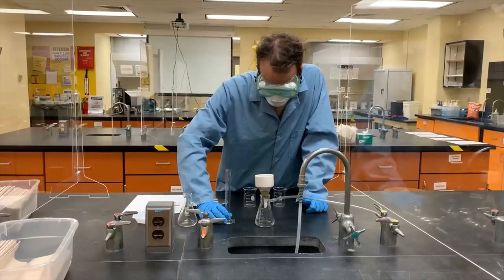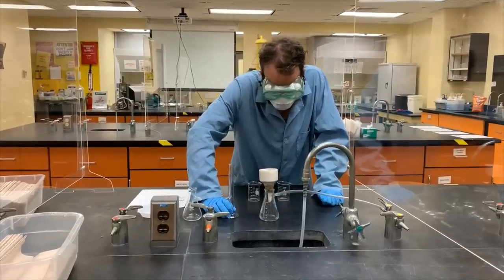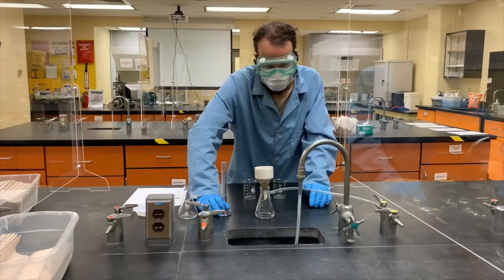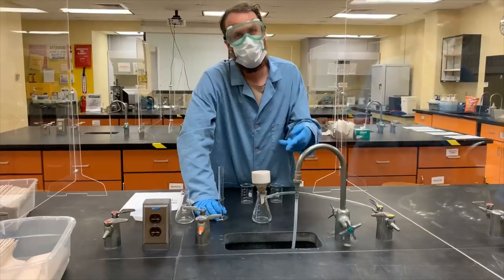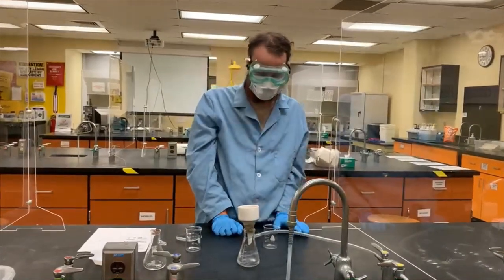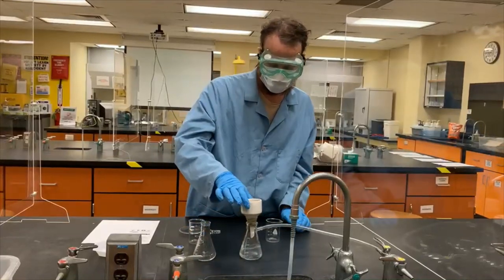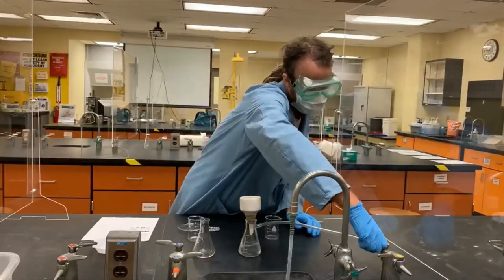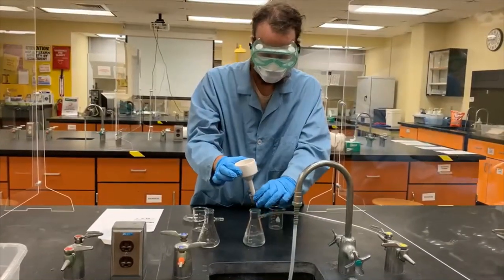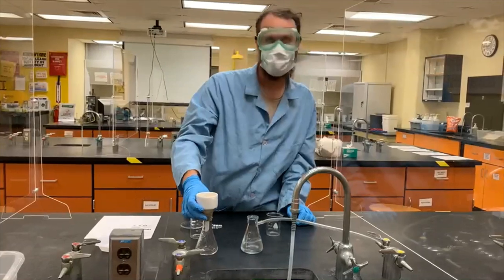So basically, the ethanol dissolves the salicylic acid and it passes through the filter paper. So now down here, we have ethanol and salicylic acid, and up here we should have sand and salt. All right, so once that's had a chance to filter out and into our little flask here, we're actually going to take our filter and our funnel. And we're going to swap out for a new flask.